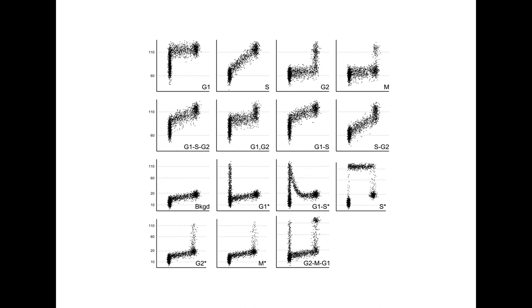In general, DNA is the primary base marker. It provides a three-compartment subdivision ordered in time, G1, then S, then G2 plus M. Periodically expressed genes or activities subdivide these phases further with the goal to create a model with objectively defined compartments that are unambiguous. That is, the cells pass through each compartment unidirectionally once. This slide shows two-parameter histograms of data synthesized from expression profiles of such periodic expression.